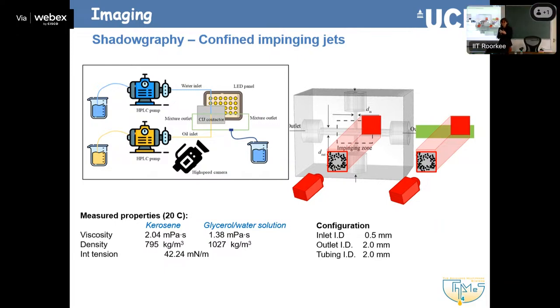And it's quite nice that glycerol water mixtures were mentioned. Of course, by adding glycerol in water, you change the viscosity mainly, a little bit the density as well. One thing we play a lot with glycerol in water is because we can match the refractive index, or we can bring closer the refractive index of the aqueous phase to the organic phase. In a minute, I will say why this is even more important when we use lasers.